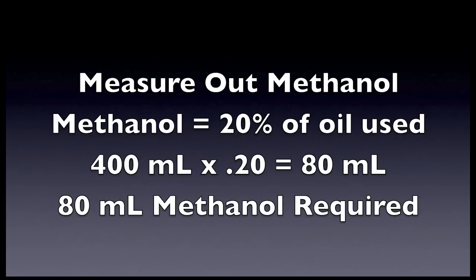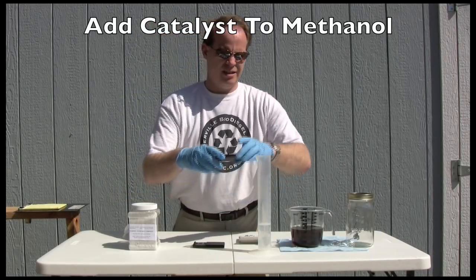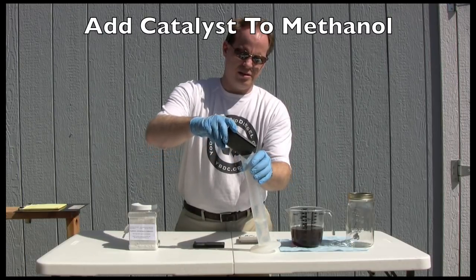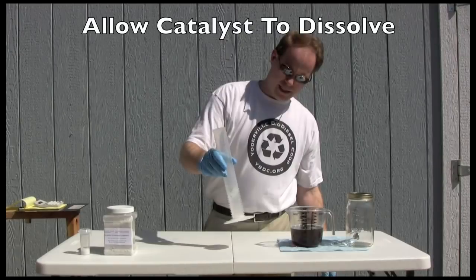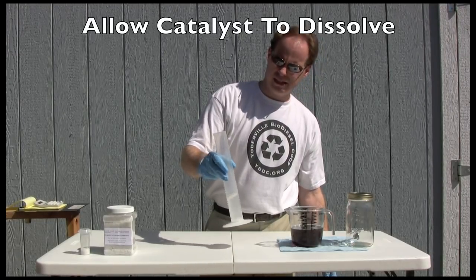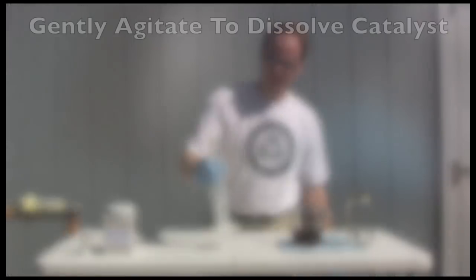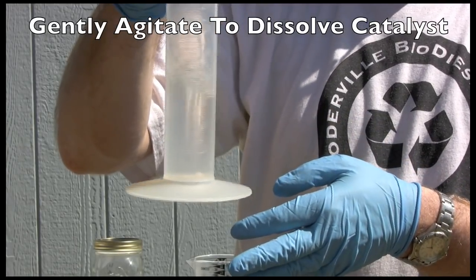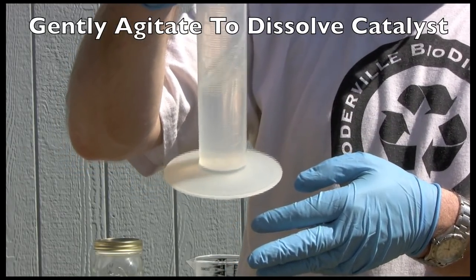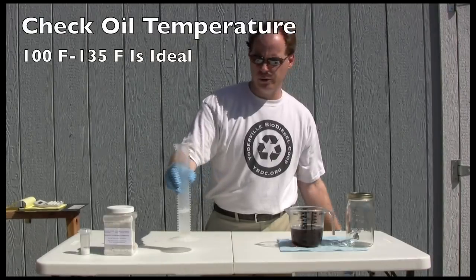We're going to measure out 4.4 grams and put it in 80 milliliters of methanol. I just have a scale here — I've tared it to zero — so I'm going to start putting some on until I get to 4.4 grams. Then into the methanol it goes. It's going to take about five minutes for your catalyst to dissolve into your methanol — it might take a little bit more — so we're just going to shake this up. Once it's fully dissolved, we'll get ready to make the biodiesel. This is what the potassium hydroxide looks like as it's dissolving — it's just going to liquify.